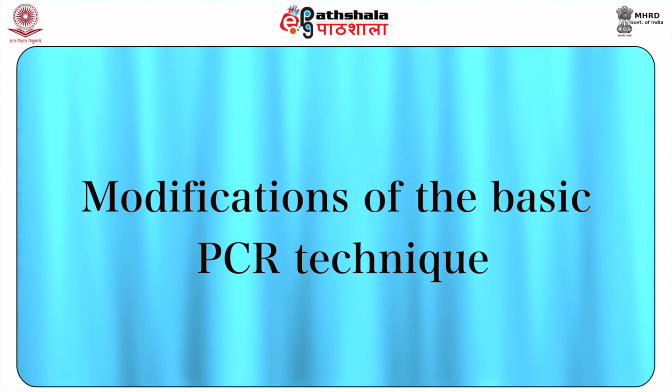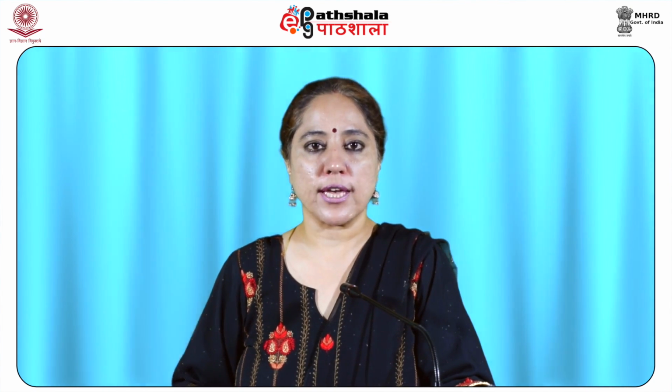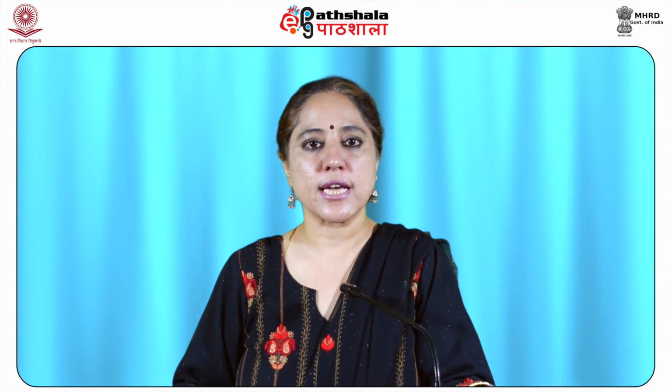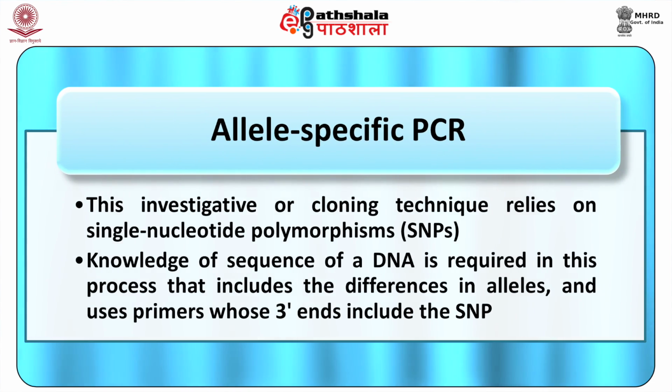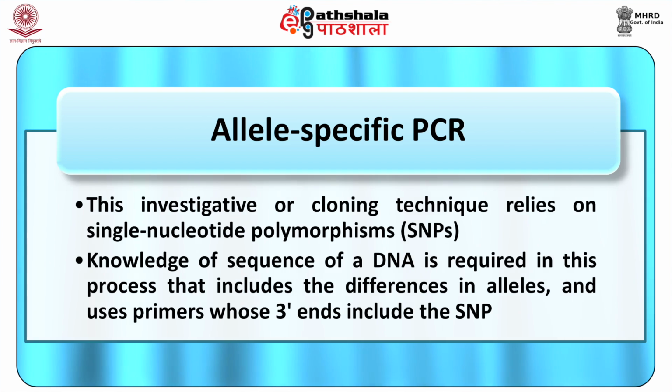Modifications of the basic PCR technique. Many modifications of the basic PCR technique have been made and are aimed at specific outcomes, yet all these modifications are based on the basic principles discussed in the previous section. The allele specific PCR. This investigative or cloning technique relies on single nucleotide polymorphisms, also called SNPs, which differ at a single base in the DNA sequence.